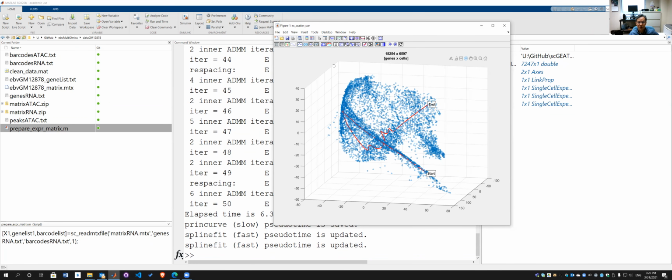If you have your R package installed, you can use monocle, which is another method to build the trajectory and the pseudo time. I have that installed, so I can click and run. But if you want to know how to install that, read the package of monocle, which is an independent third-party software package in R. So if you click this button, this application will call that function to generate the pseudo time. But I'm not going to try this because that will be slow.